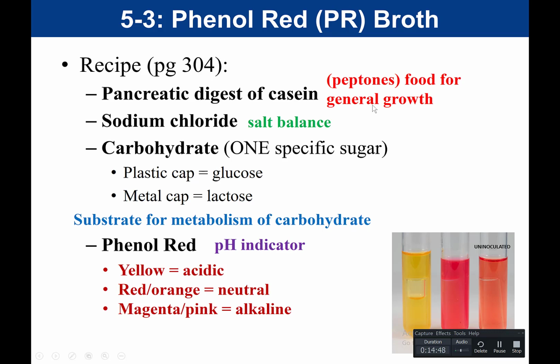Basically, it's providing these chemicals, these nutrients, like a source of nitrogen, for example, that bacteria would need to grow. And as a result, in a Phenol Red broth test, you should see growth to say whether it's a positive or a negative. If you get no growth, we say that that is inconclusive. And I'll come back to that in a little bit.